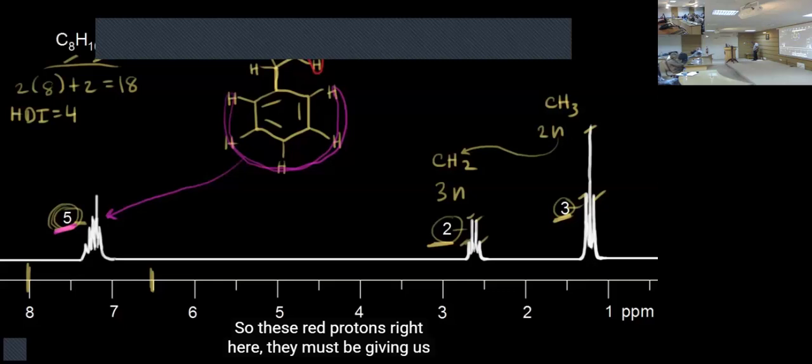Otherwise, you could exactly see a doublet of an ortho-coupled proton or a meta-coupled proton. Right now, you have 5 protons. And if you see, all these protons are either ortho-coupled with each other or meta-coupled with each other. So coupling is there, but there is no substituent in between. So definitely they appear as a multiplet. Because all these ortho couples, you understand ortho coupling, right? The 2 protons in adjacent carbons, vicinal carbons.